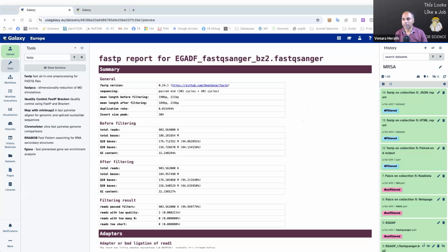Okay. And the question is why we are doing taxonomic profiles. In this case, as I mentioned earlier, we want to see whether it's a Staphylococcus aureus and what kind of strain of Staphylococcus aureus. This is more like a diagnostic setting as well.